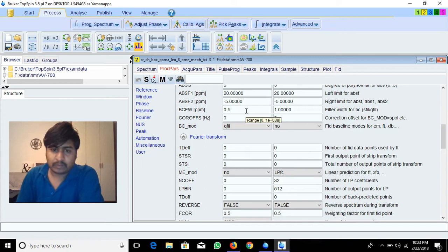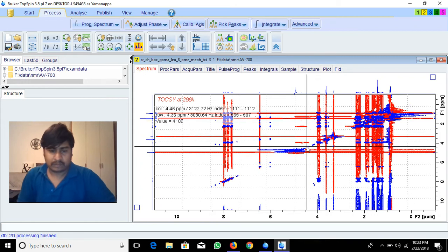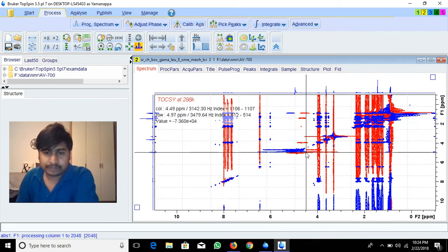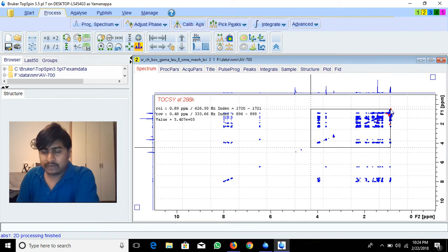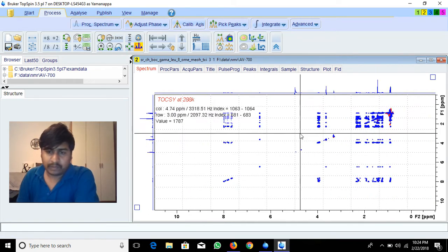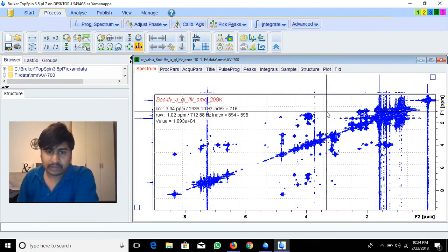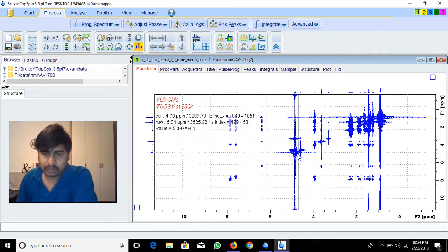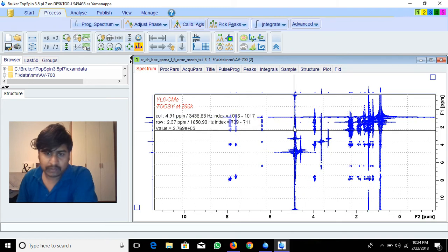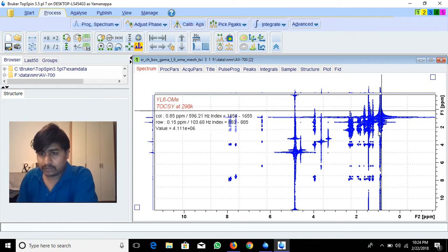Setting it back to 0.5 and running xfb gives the correct result with peaks preserved. Now, for T1 noise: when you record a COSY spectrum or any TOCSY, you will have T1 noise. Here in this TOCSY example there is a huge noise below the water peak, and also significant T1 noise.